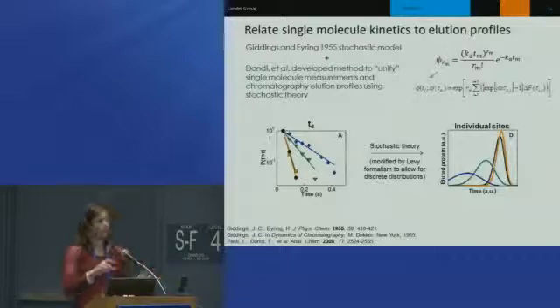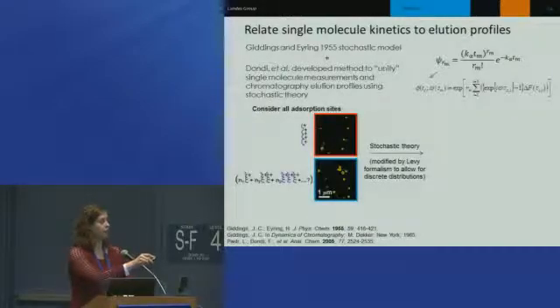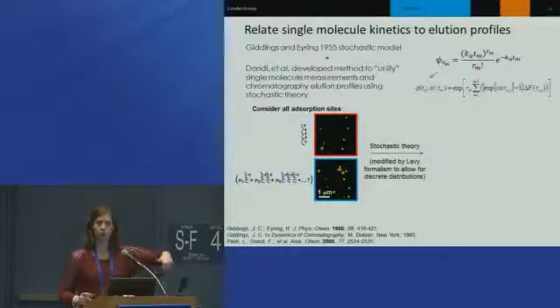And so you can take each one of these types of interactions from the rate constants and say exactly through this theory what sort of elution profile should result. And more importantly, you can compare the kinetics that you extract from our intentionally engineered clustered peptide. Remember I said we had turned on the clustering once we went up to 1,000 times higher in loading density for our monopeptide, and we can also extract the rate constants here.